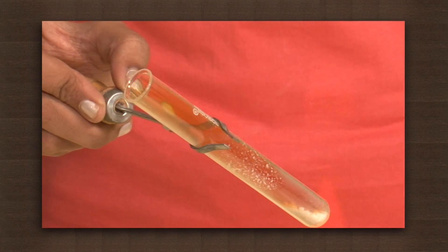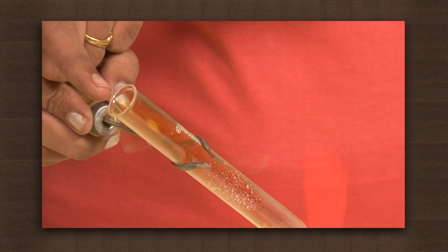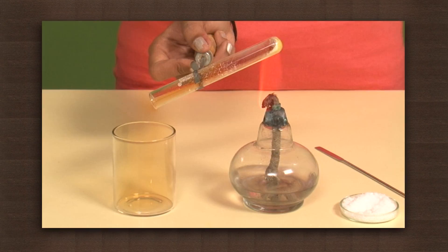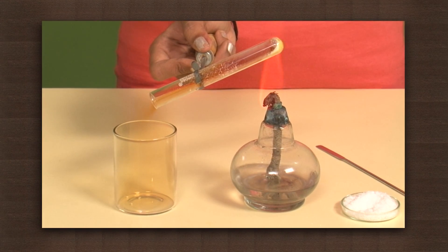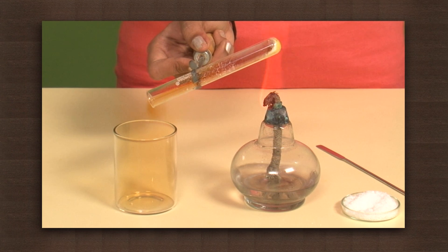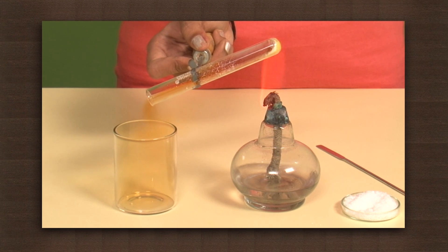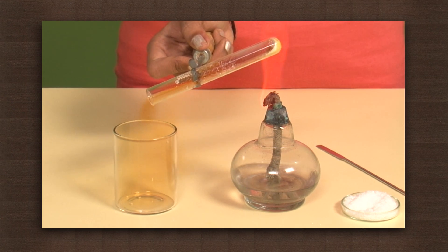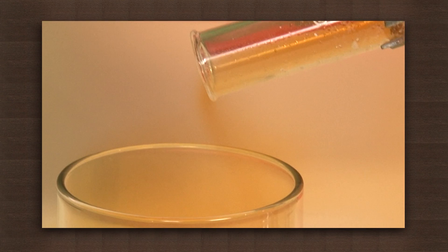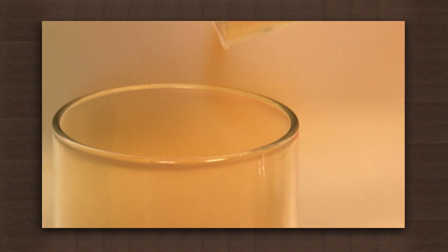After some time we see brown fumes coming out of the test tube. Now tilt the test tube and the fumes will flow down. These brown fumes are of nitrogen dioxide.